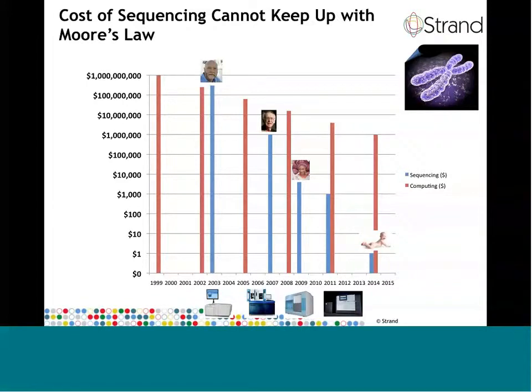The cost of sequencing has completely outpaced the cost of computing, represented by the famous Moore's Law, displayed here as well. But all these costs pale in comparison to the cost that is introduced when it comes down to analyzing the result of sequencing experiments.